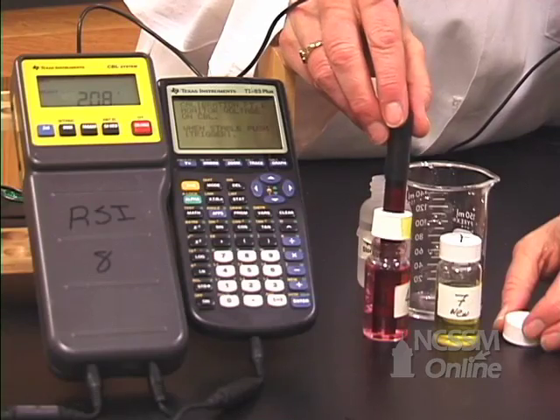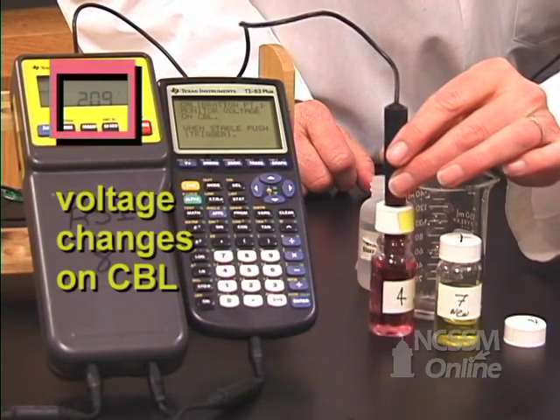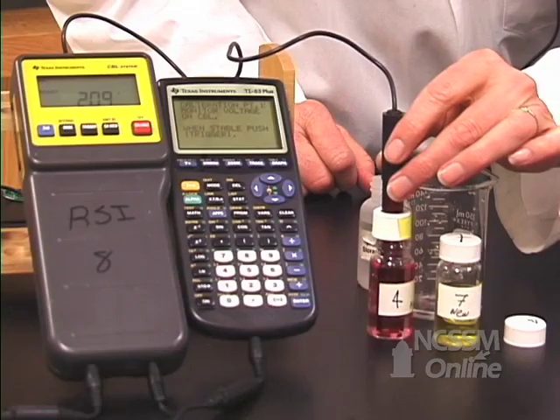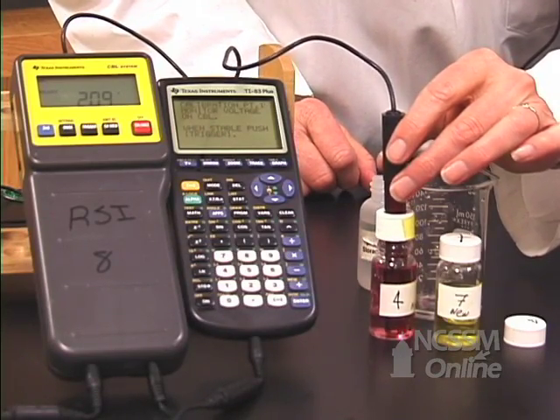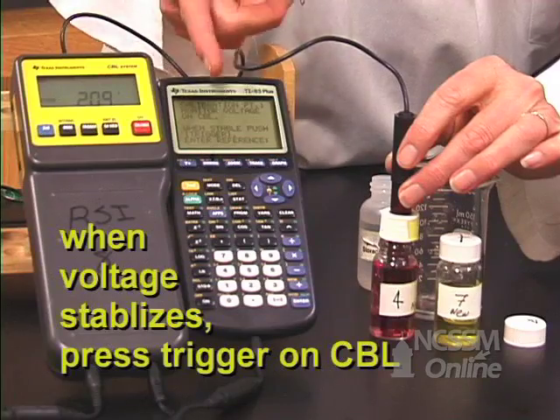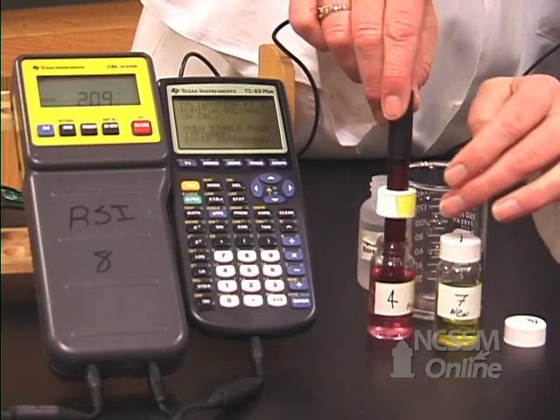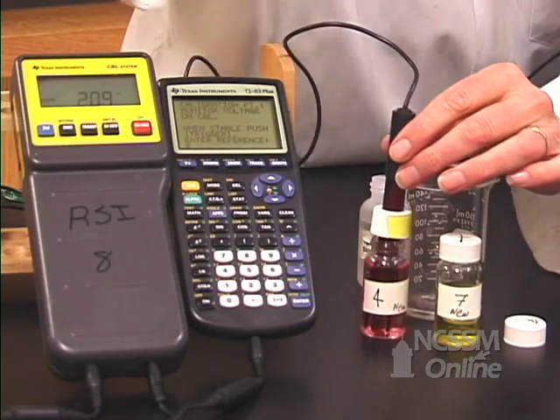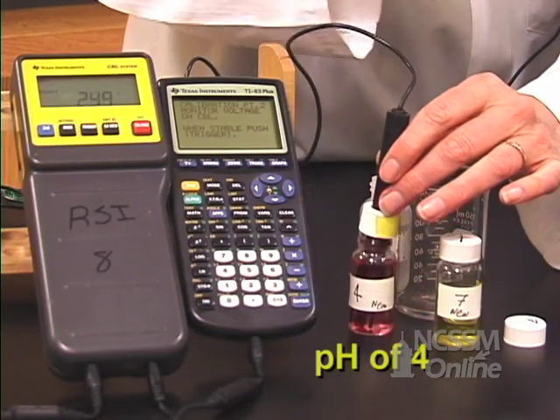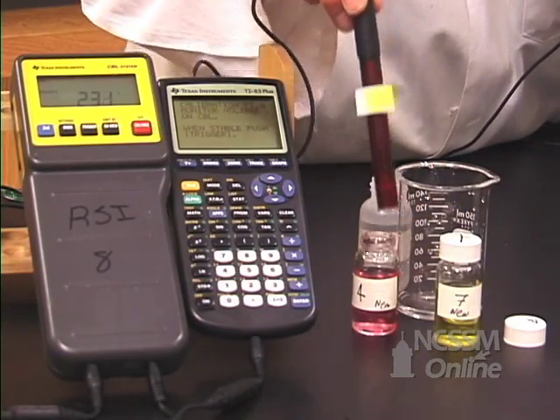Put the probe into a known buffer with a pH of 4. Watch what happens on your CBL — you can see the voltage is changing, but now it's staying constant. When it stays constant, press trigger. On the CBL it says 'Enter the reference point.' Since we're using a pH of 4, type in 4 and press enter. It's saving that voltage value and converting it to a pH.